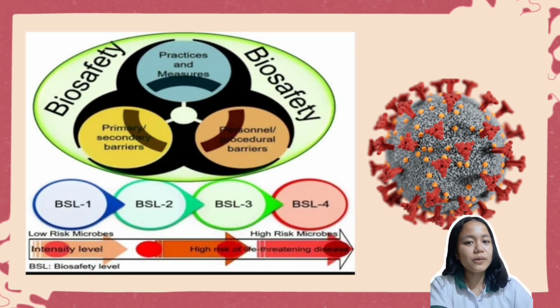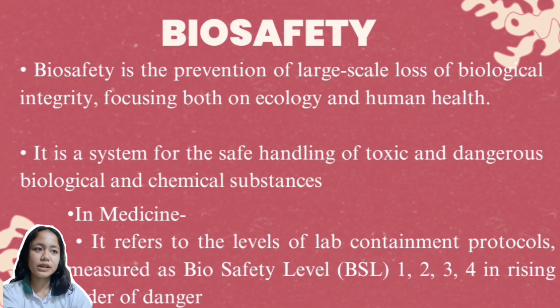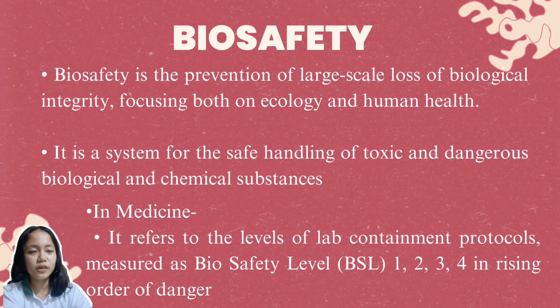And today we are here to discuss and present about biosafety in the laboratory. So now let's start the discussion. So first, what is biosafety? Biosafety is the prevention of large-scale loss of biological integrity, focusing both on ecology and human health. In medicine, it refers to the levels of lab containment protocols measured as biosafety level 1, level 2, level 3, level 4 in order of danger.